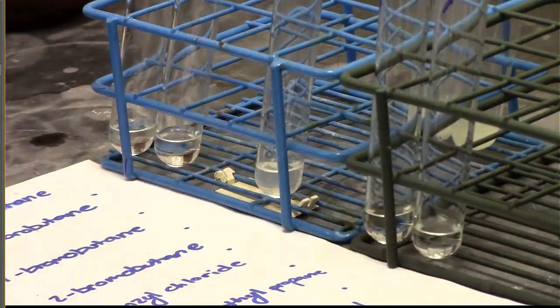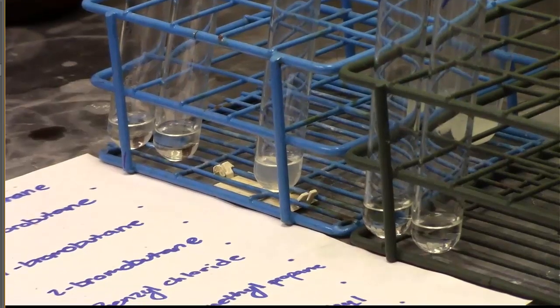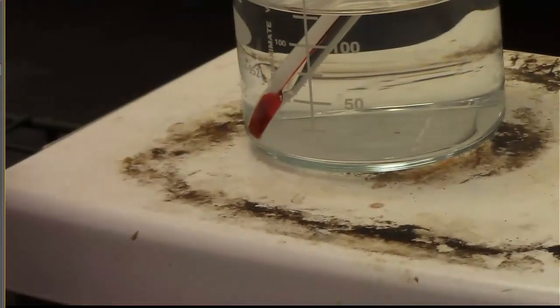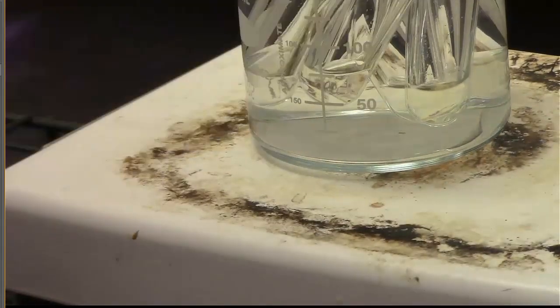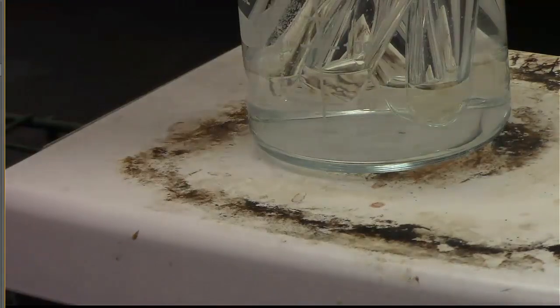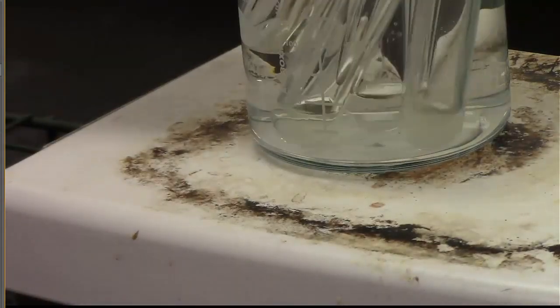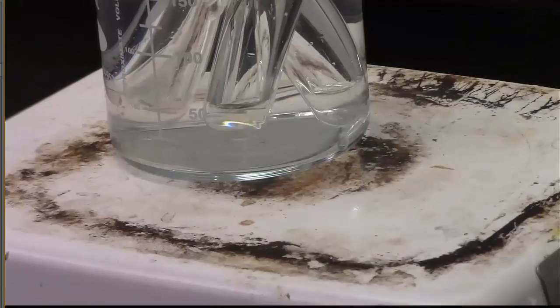With the benzyl chloride, though, that definitely was second place. We had quite a bit of precipitate accumulate after about 5 minutes or so, and now we're just before the 10-minute mark. But we should note that 2-bromobutane had some precipitate in it. It was very faintly clouded, so I wouldn't necessarily call that the end time yet, especially when we compare that to our 1-bromobutane and benzyl chloride. So we'll put all those in the hot water bath. Keep an eye on it while it's in there, and then check it also as we go.